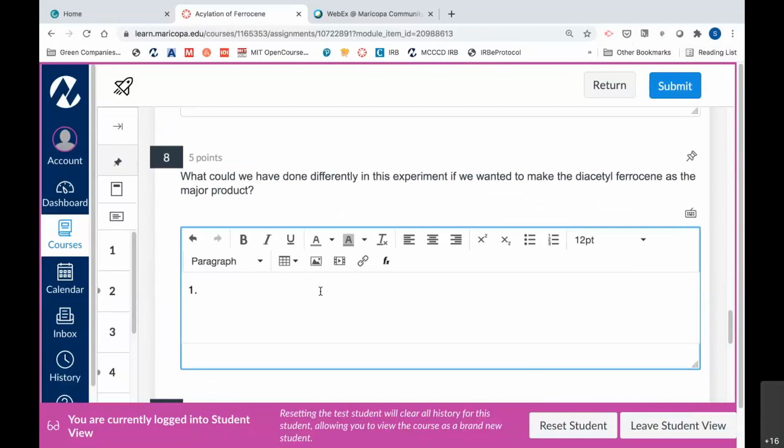You need more acetyl groups. So if you add water, you will kill the reagent, Samantha. You will destroy the acetic anhydride. So don't go that way. I want more acetyl group. So maybe add more acetic anhydride. Just provide enough of that reagent. Don't go the other direction. Don't add water, but instead add more acetic anhydride.